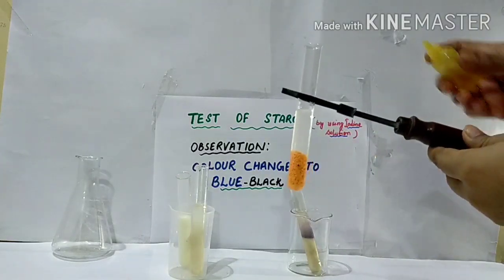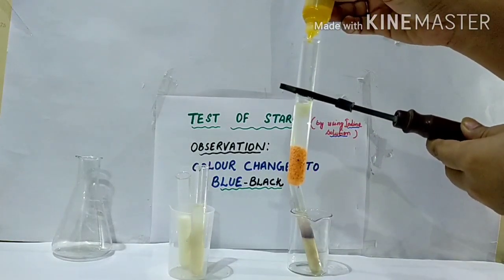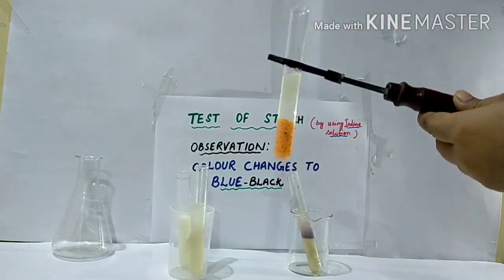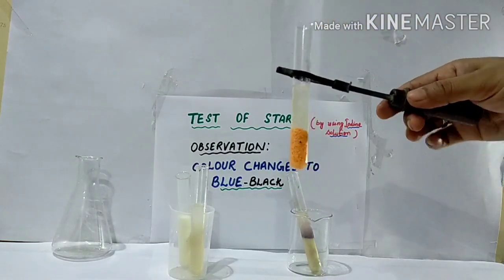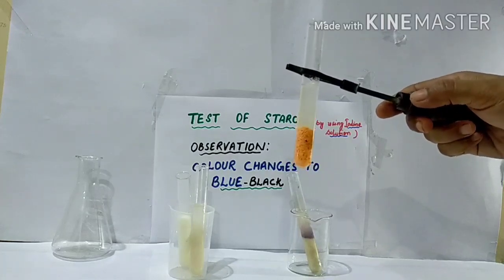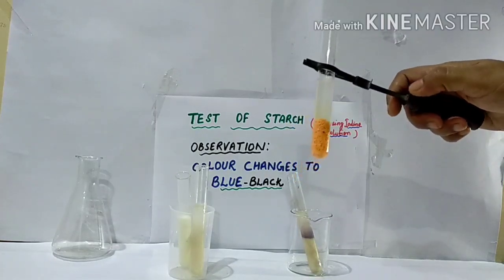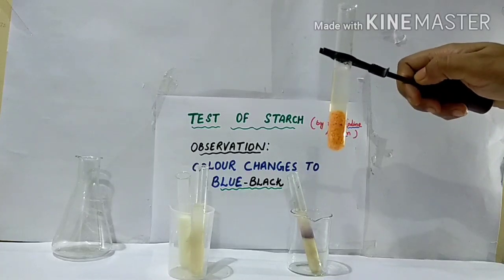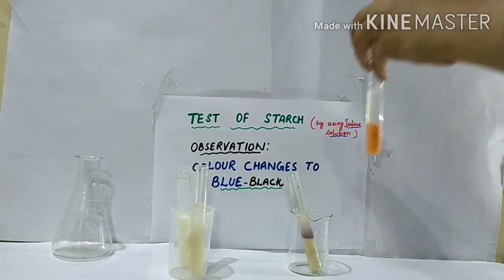Next, I will take pulses. I have taken pulses and I will add a few drops of iodine solution into them. You can see the color has not changed. It means that pulses do not contain starch — we all know pulses contain protein.